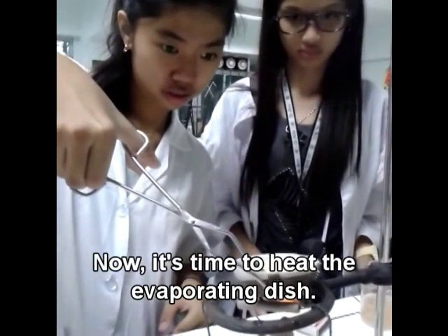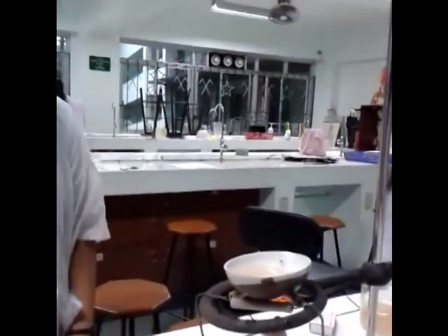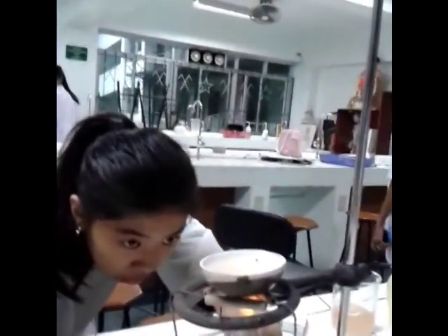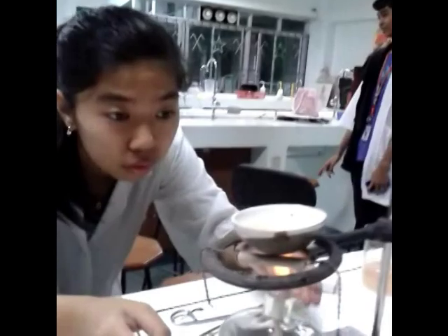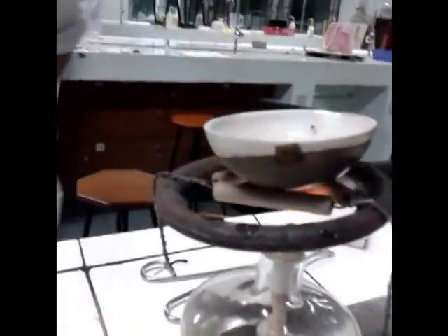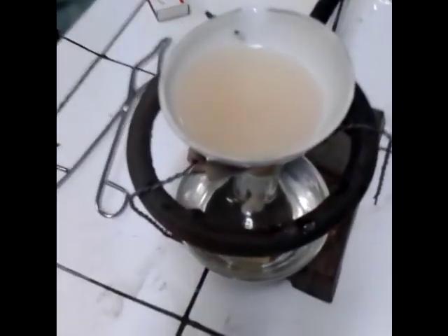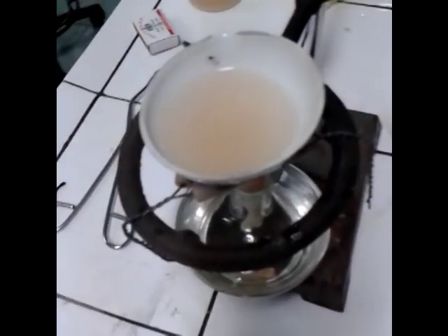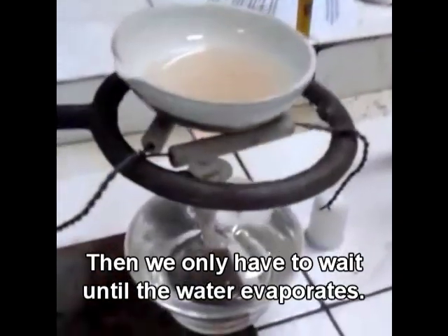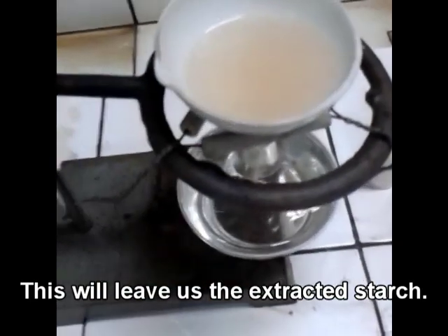Now, it's time to heat the evaporating dish. Then we only have to wait until the water evaporates. This will leave us the extracted starch.